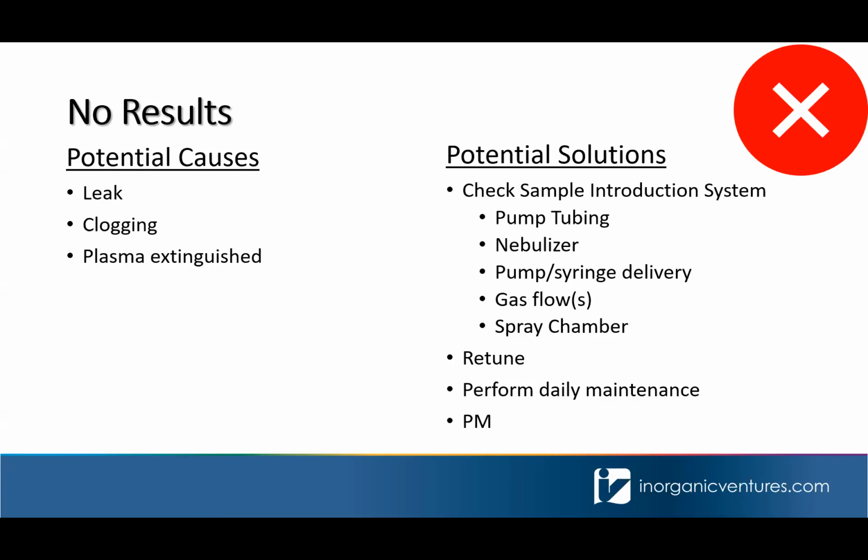Once you think your clog has been resolved, you can do a quick sodium or yttrium bullet test to see if solution is flowing through your system appropriately, or you can look at the counts of your internal standard to see if you're getting proper sample delivery now.